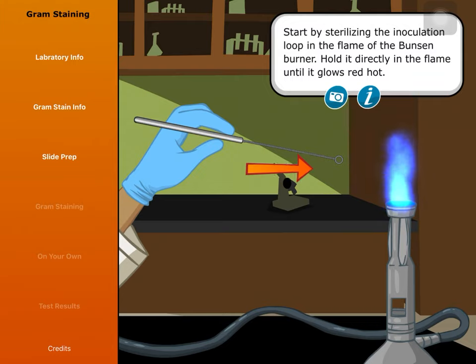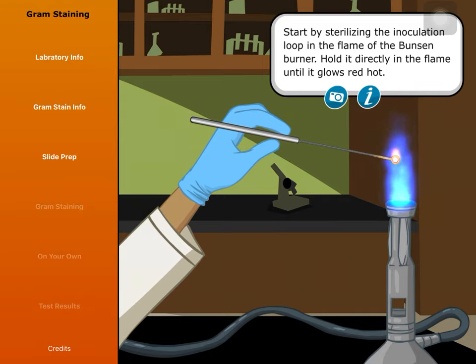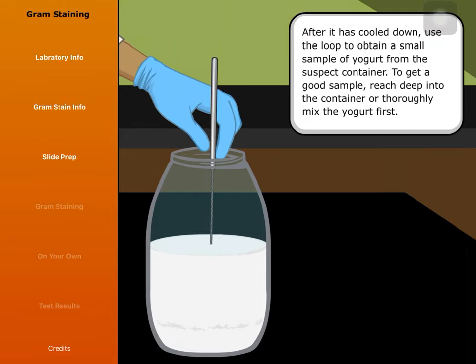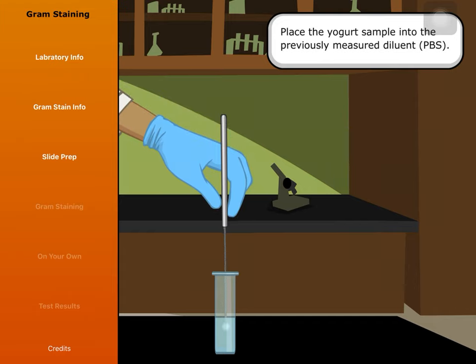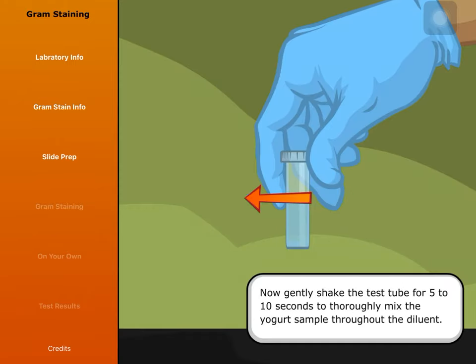Start by sterilizing the inoculation loop in the flame of the Bunsen burner. Hold it directly in the flame until it glows red hot. After it has cooled down, use the loop to obtain a small sample of yogurt from the suspect container. To get a good sample, reach deep into the container or thoroughly mix the yogurt first. Place the yogurt sample into the previously measured diluent, PBS. Then gently shake the test tube for 5 to 10 seconds to thoroughly mix the yogurt sample throughout the diluent.